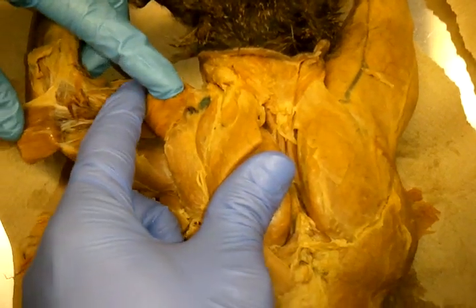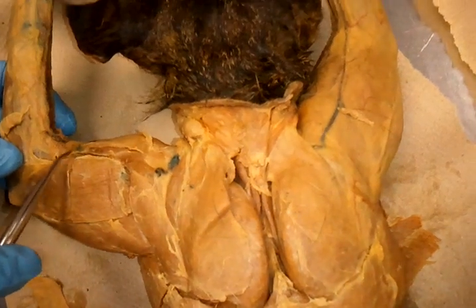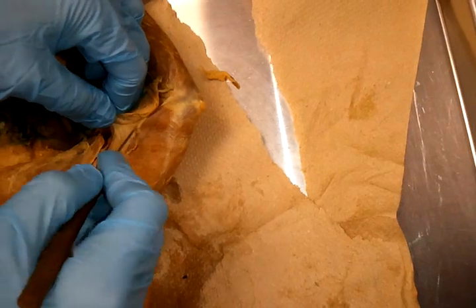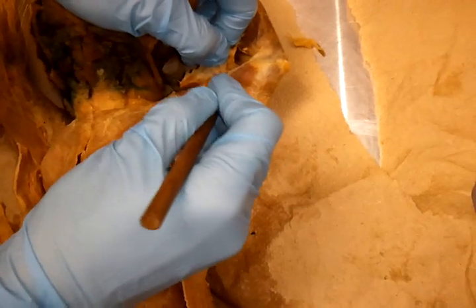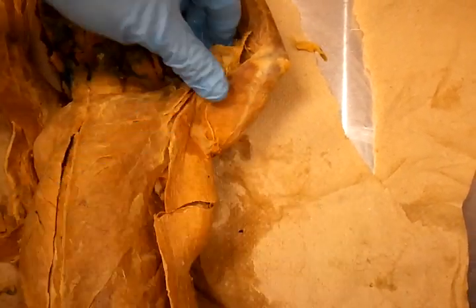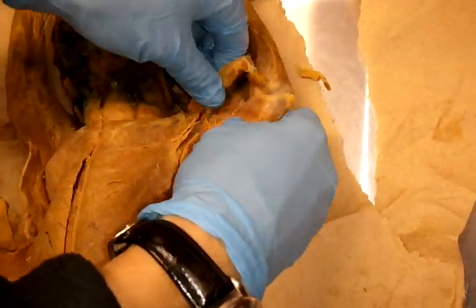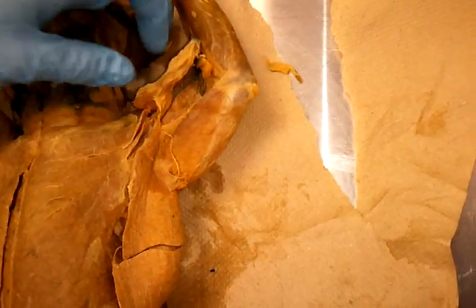Brachialis is underneath the deltoid — deep to the deltoid — but you can still see a little brachialis here. And then we go for the biceps. Biceps is deep here in your upper arm. We're going to skip some muscles that the cat has that we don't have. But deep to those muscles you'll find your biceps brachii.